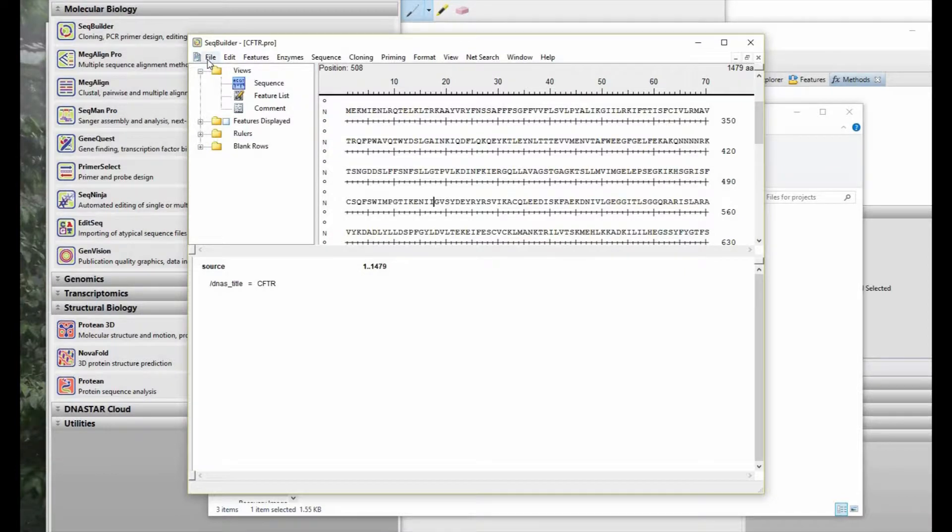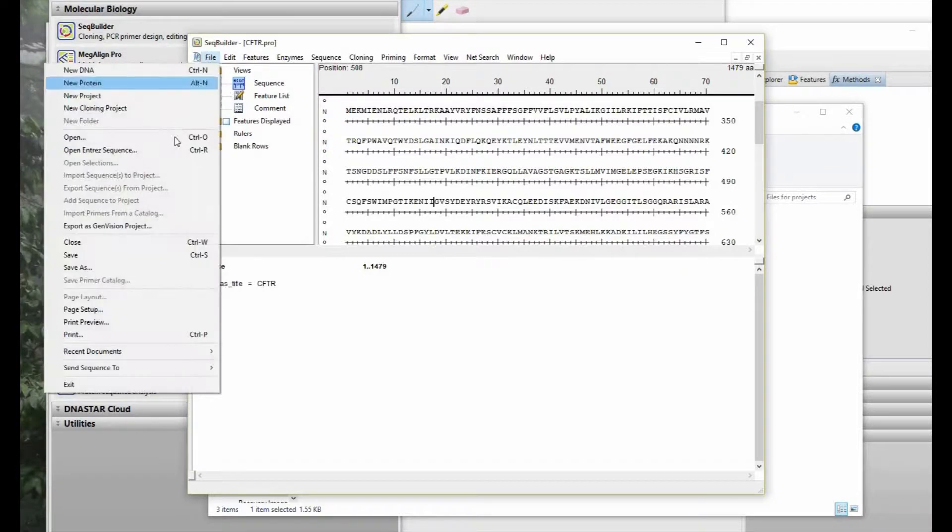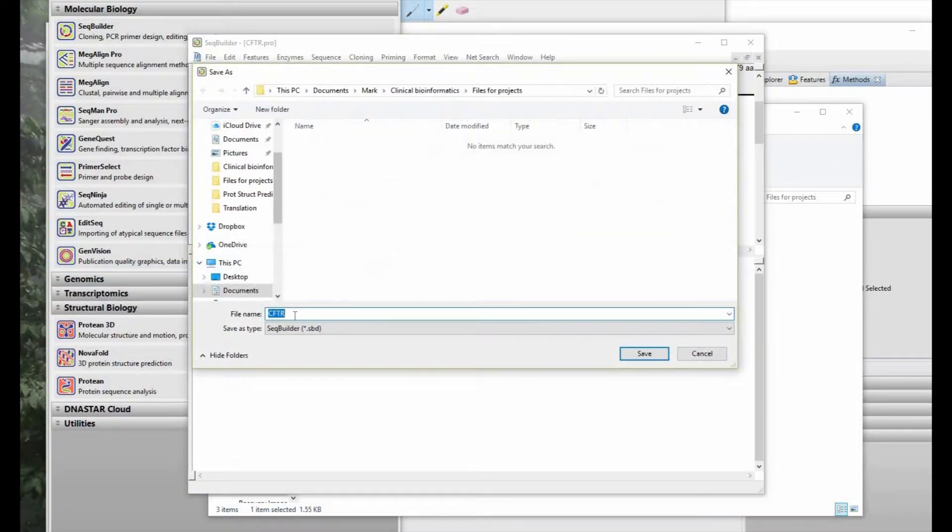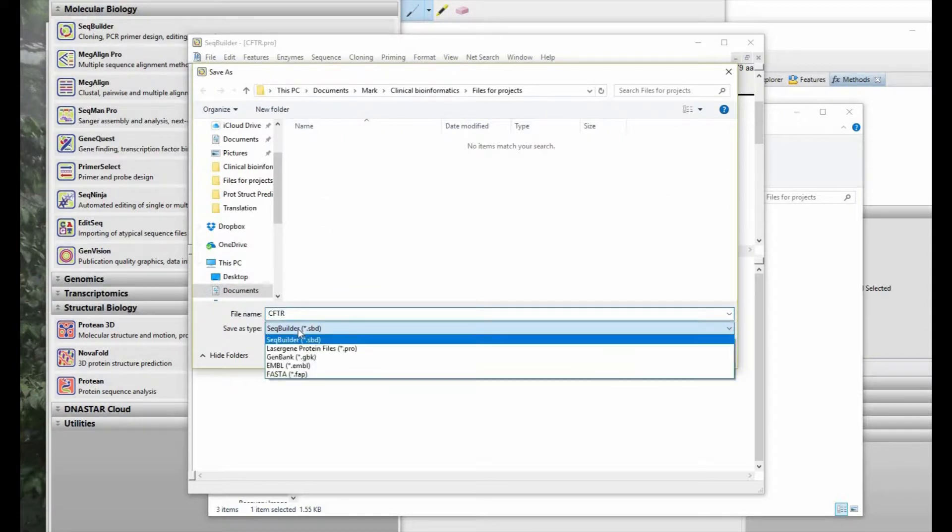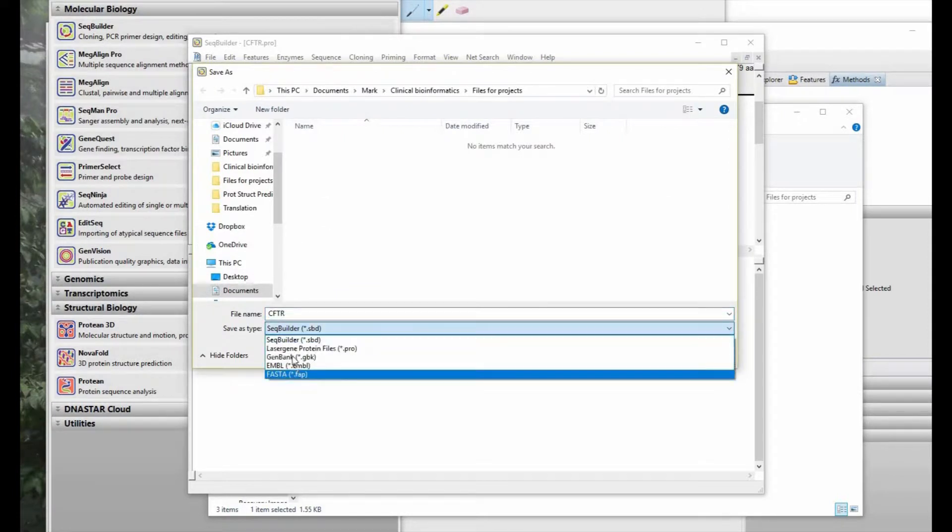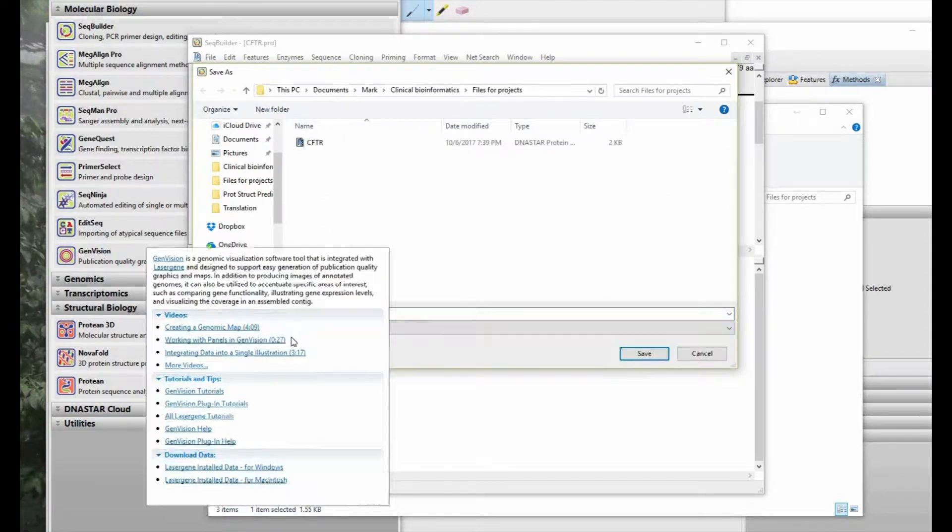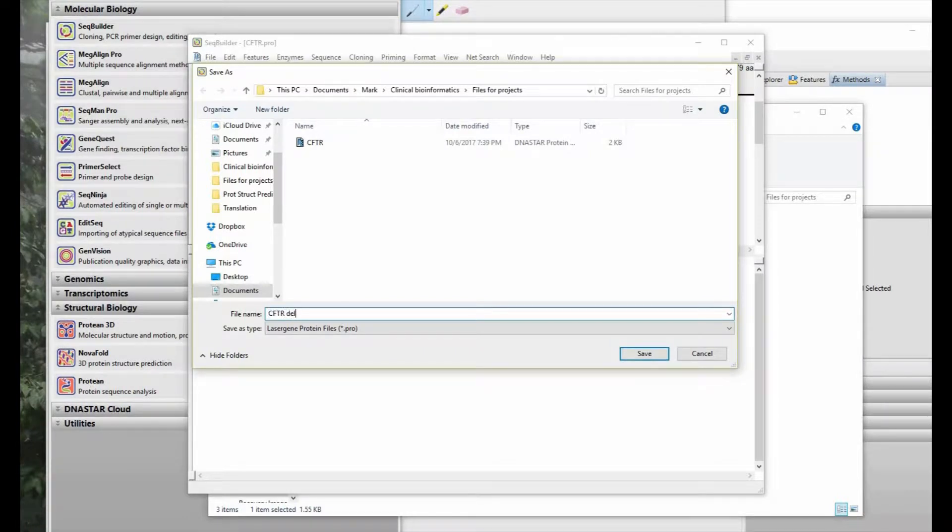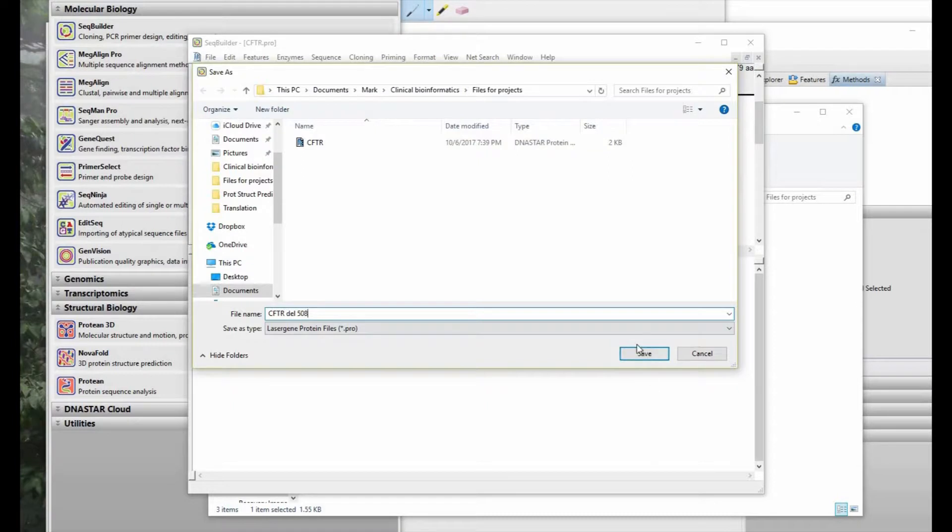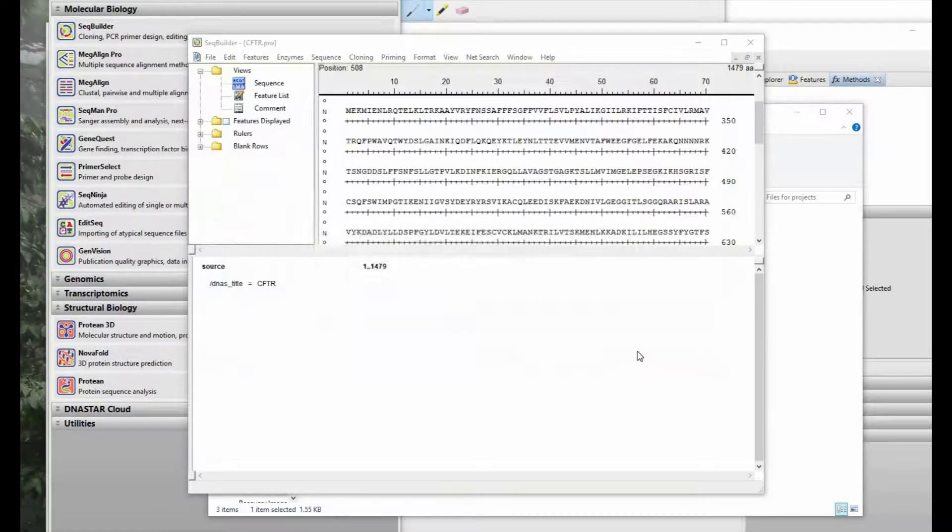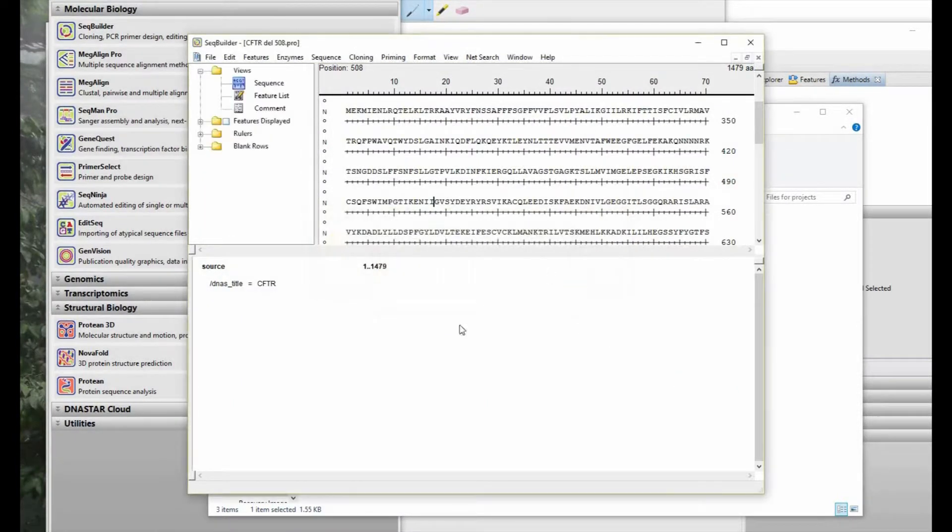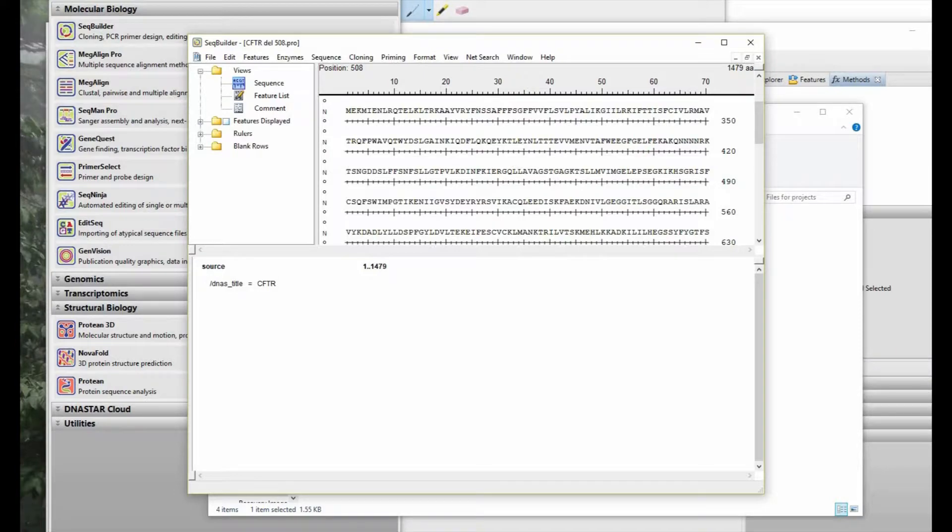In our case, we just delete it. And then we choose Save As and create a new file with a naming convention that reflects the change that we made. Select the laser gene protein format in order to make the other exercises easier. And then we did a del508, so we'll use that naming convention. Then you save your file. Now you're ready to move forward.